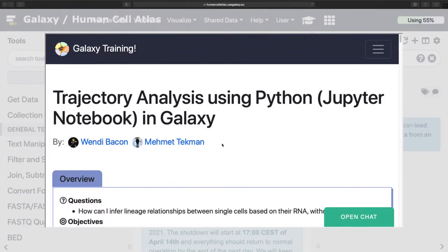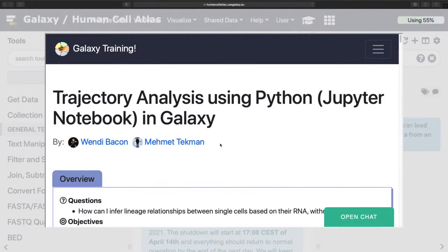The Galaxy Notebooks, or the Jupyter Notebooks, work in many different instances of Galaxy. So you've just got to check if that tool's there or not, and if not, follow on to usegalaxy.org. Usegalaxy.eu can both perform this tutorial.